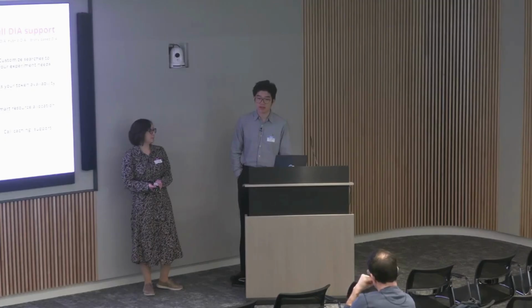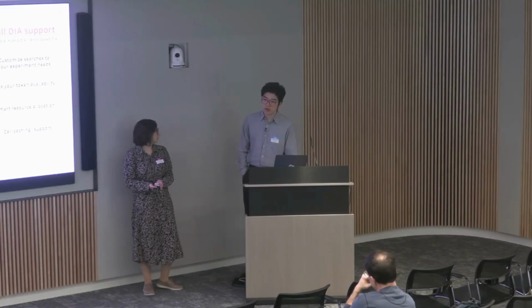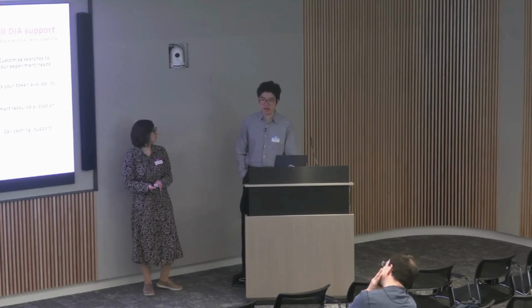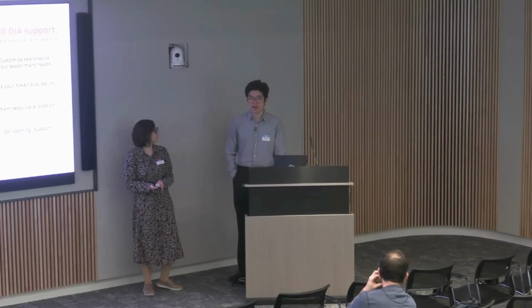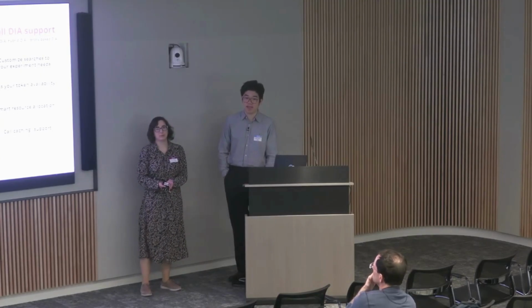Do you have an idea what the increase will be if you have 100 seats? Just for the speed, I would say the recommended number of files per VM is around 2 to 5 files per VM. Usually you'll definitely not get 6 times faster, but every file takes about an hour to process in those parallelized tasks.